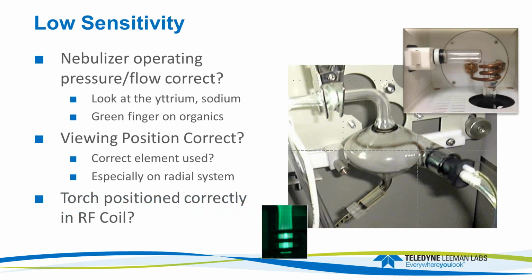Having no sensitivity is actually probably relatively easy to diagnose. It really tells you, man, something is just wrong or broke. Low sensitivities can be a little trickier: things are working, but they're not working really well. So for low sensitivity, I just suspect, how's the nebulizer? Is it running at the right flow or the right pressure?